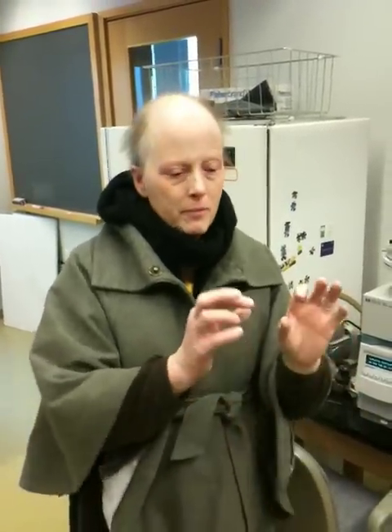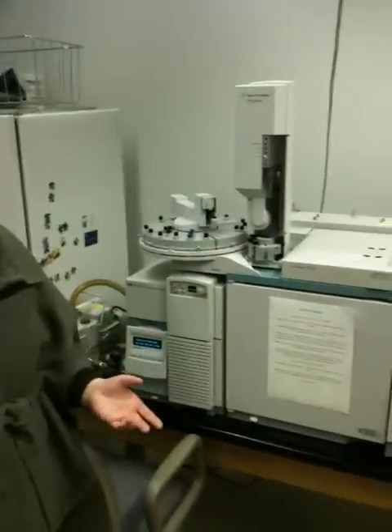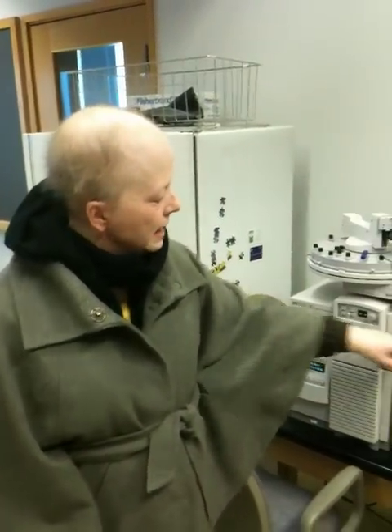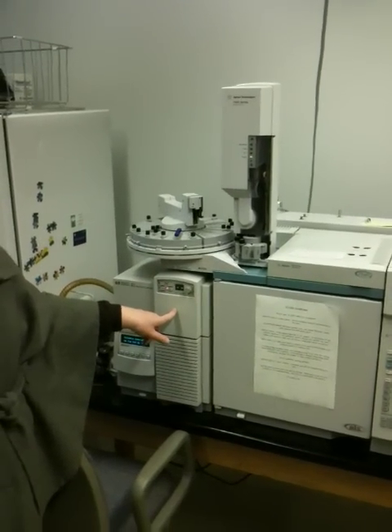I always say to students: wouldn't it be cool if you could shoot your samples into a GC and, when the sample is separated out, have it go right into an NMR spectrometer? If you could do that, you could identify every component of your mixture as it's formed. That's what this does — but it's just a new type of spectroscopy. When you learn the spectroscopy, you can identify compounds just as well as with an NMR. In class, you're going to get all the theory behind this, but think of it as a basic separation technique followed by a sophisticated analytical technique.